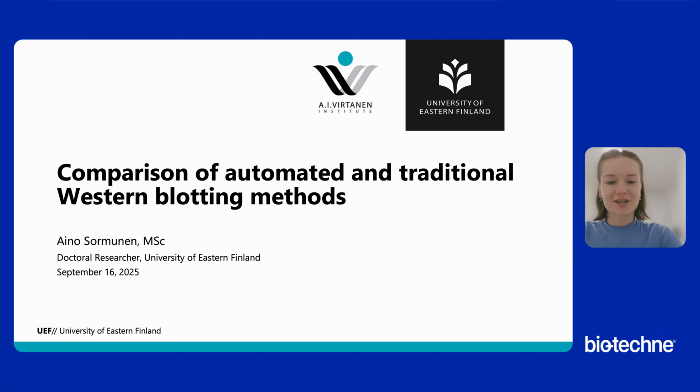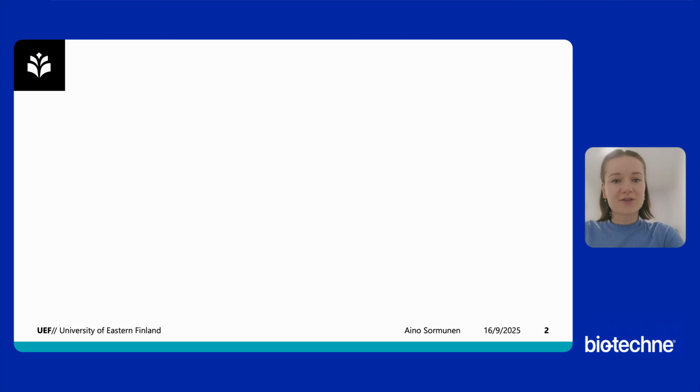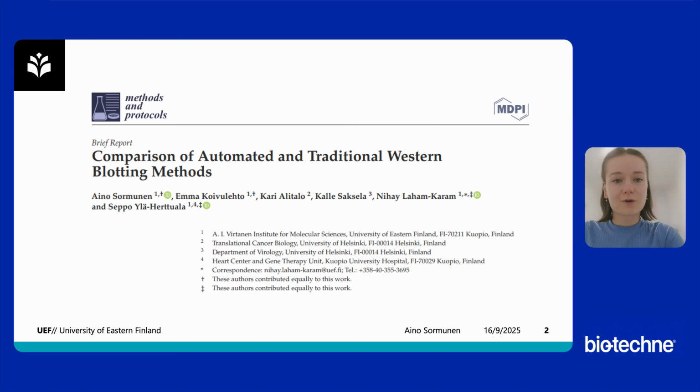Hello, and thank you for the introduction. My name is Aino Sormunen, and I'm a doctoral researcher at the AI Virtanen Institute in the University of Eastern Finland. The reason I'm here today is that a couple years ago, me and my colleagues published an article where we compared the traditional Western blotting method to a couple of automated ones, and today I will walk you through a short summary of the work that we did.